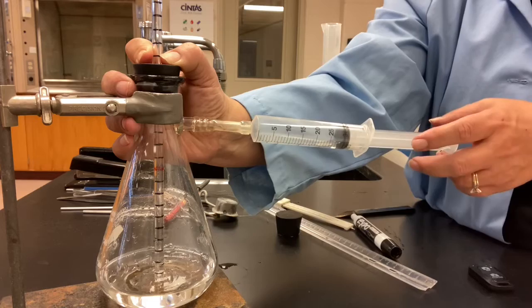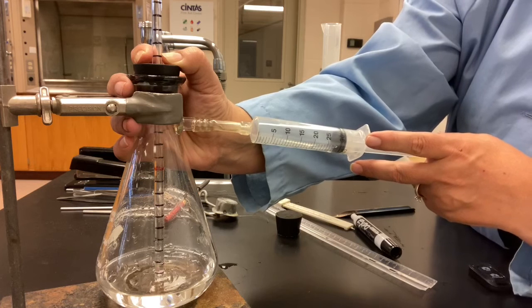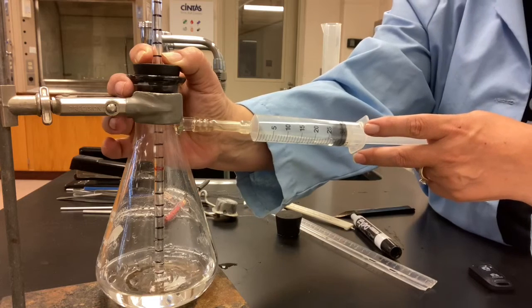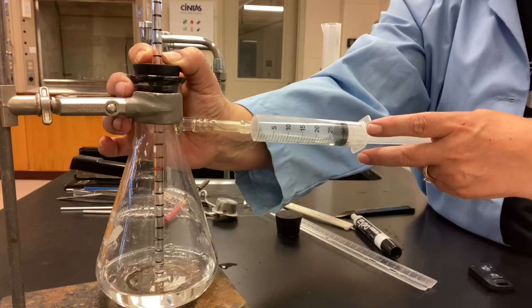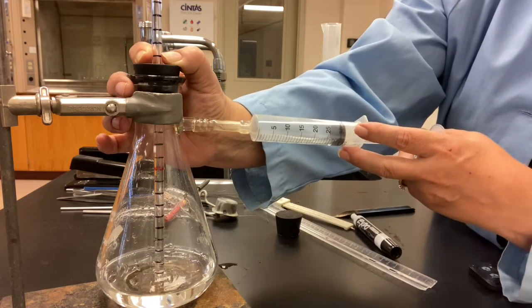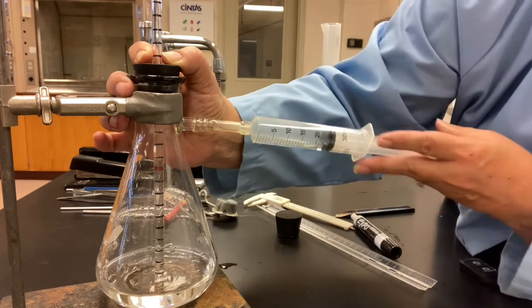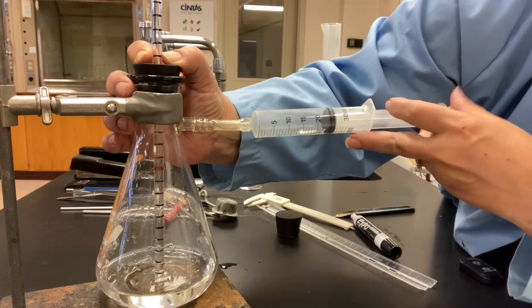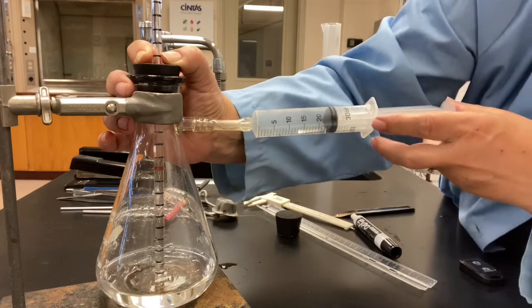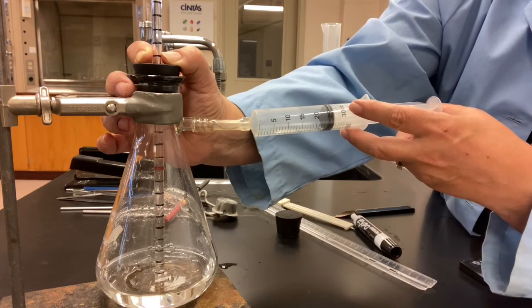So write that in, because I'm not going to write that on the board for you. You have to keep this data as we go. Now, I'm going to have to move along quickly because I don't want any sort of leaks during this process to throw the data off. I know it's a little difficult on the video, but see if you can see the water level rising as I decrease the volume of the syringe. So now I'm going to move the syringe to 25, and the value will go up. And right now, it's at 11 centimeters. So you're going to write 11 centimeters for column C, where it says 25 milliliters for the syringe.